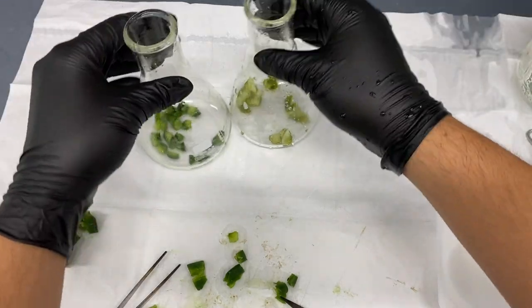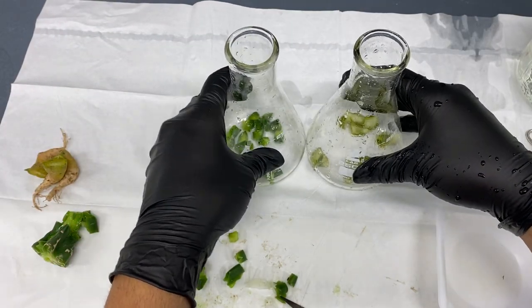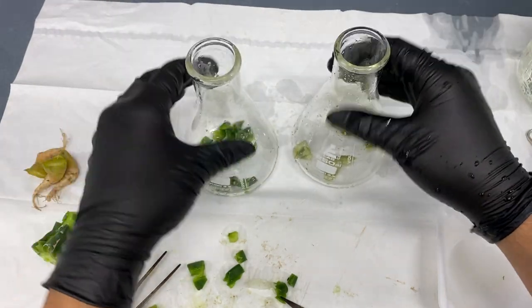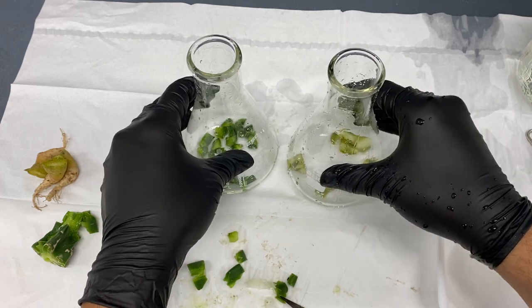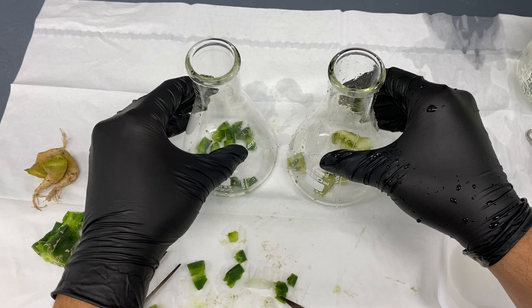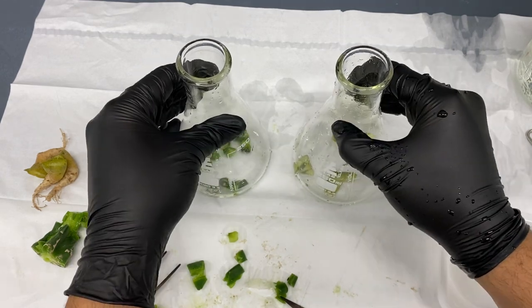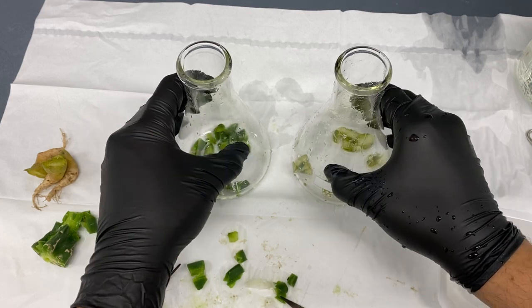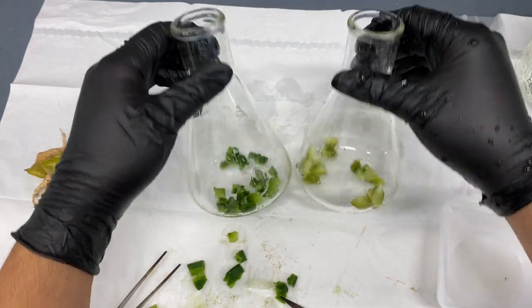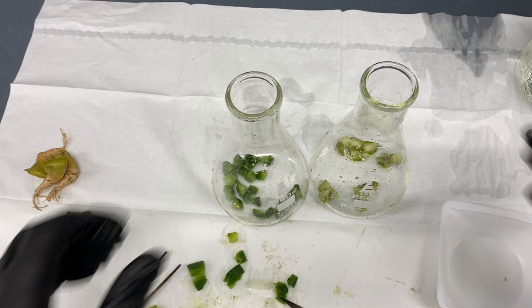From this step, I'm going to add a 20% bleach solution and they are going to sit in here for 25 to 30 minutes — most likely 30 minutes. After that they're going to be put into the tissue culture media, which I have available on Etsy. It's the same media you're going to see in this video — same hormones, same vitamins — so you can follow along and give it a try.